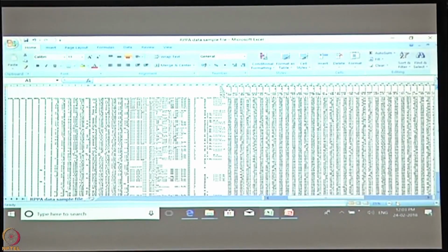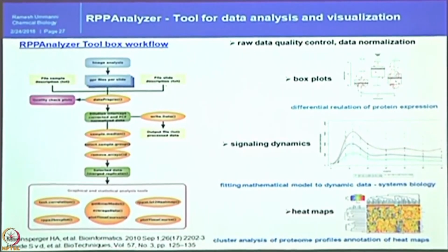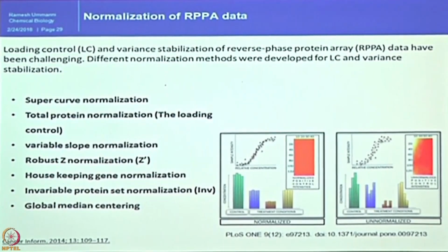So, from this if you load this data into commercially available software, as per pre-designed analysis part you will get the data output, but you cannot manage to get information what you want from your samples according to your experimental requirements. So, when you have such a high end data set, then you need to worry about how correct the experiment is. So, one of the sensitive points Dr. Sanjeeva touched in the morning very nicely and gently suggested you to follow these normalization methods.